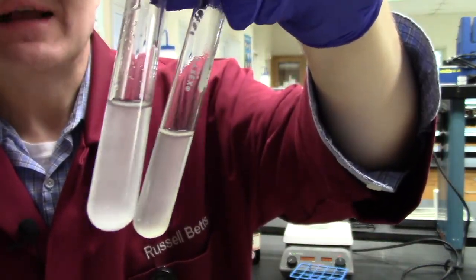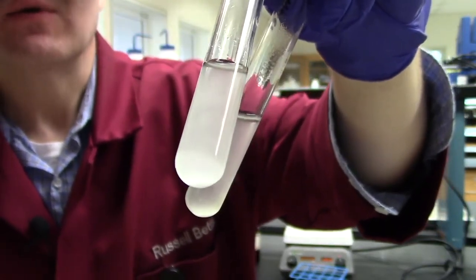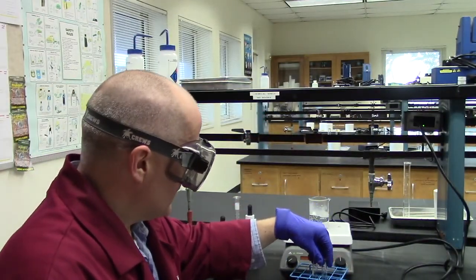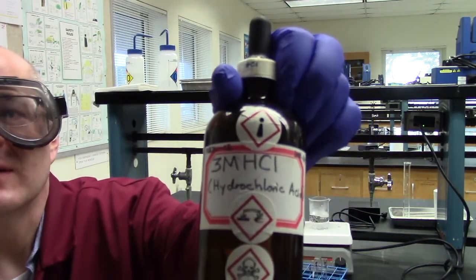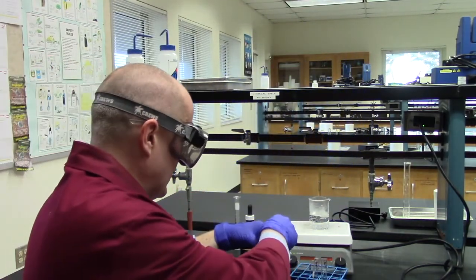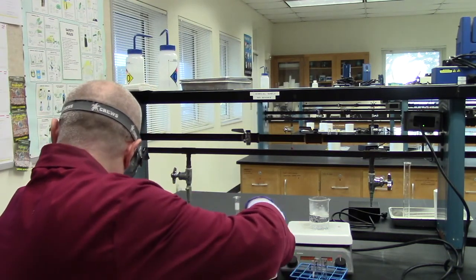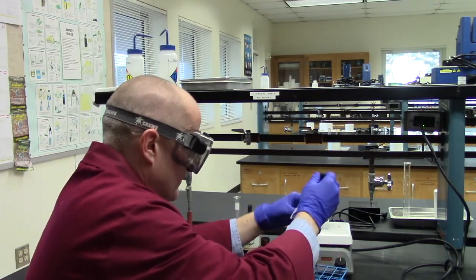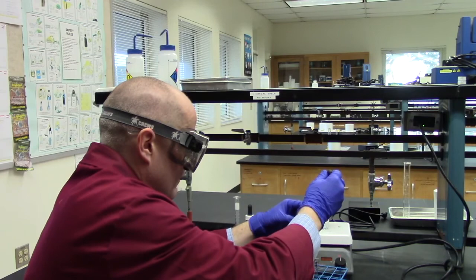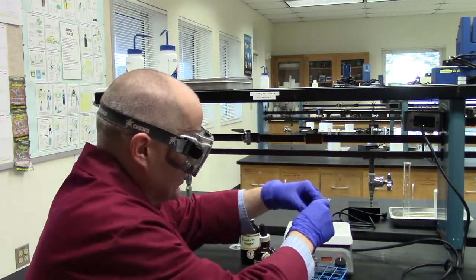So now we're going to add acid to one, water to another, and we're going to do what's called a hydrolysis reaction, or we're going to see what happens when we do a hydrolysis reaction. So let's do that. So here is my 3 molar hydrochloric acid. I'm going to add that to the one labeled acid. I think it says 3 drops. So I'm going to do 3 drops. Actually, it's 5 drops. There we go. So there's the one labeled acid.